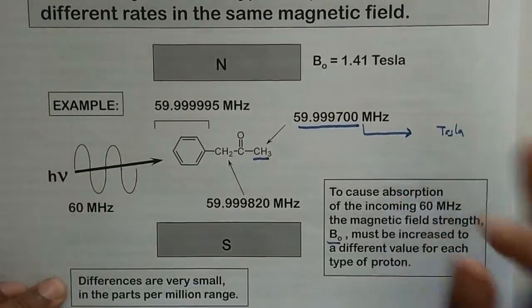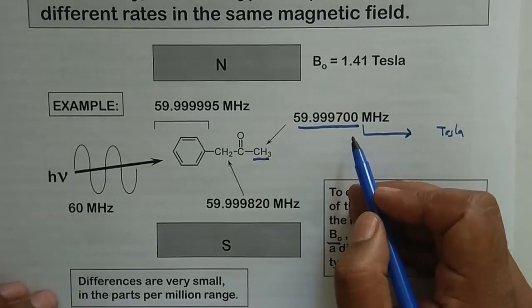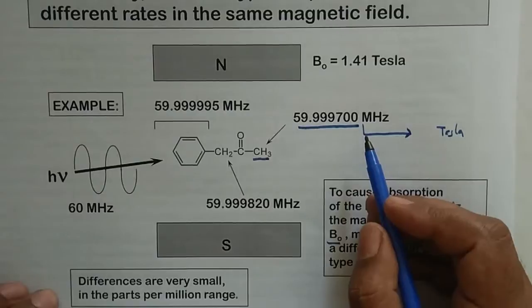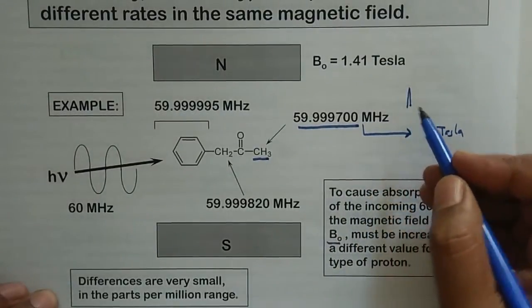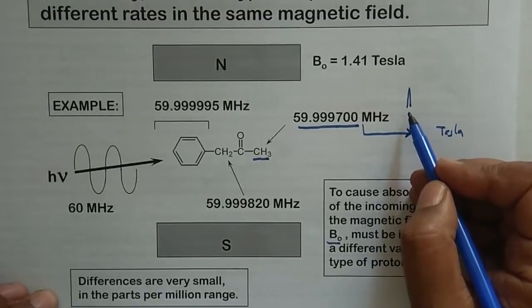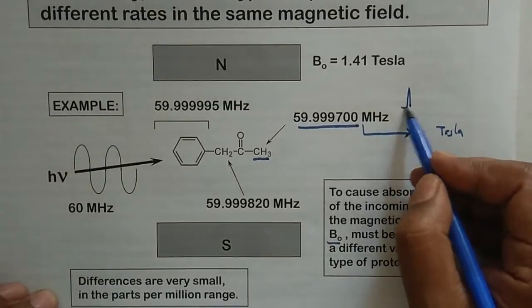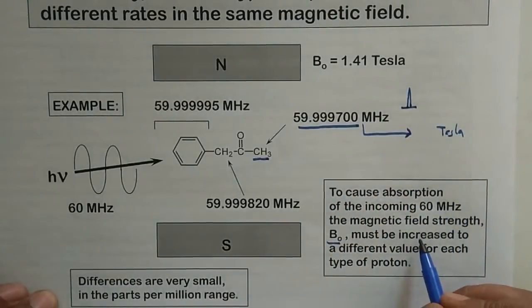Once you fix the value, you will scan your system. When you do the scanning, you have to wait for a while, and then you have a signal corresponding to this one. After some time you will not observe any enhancement in the signal. That means it is sure that now we have sufficient intensity of the signal at this magnetic field strength.